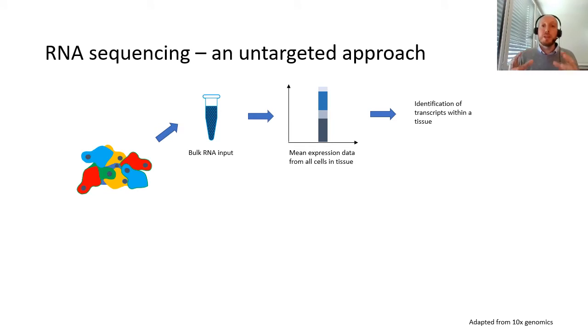So today, the predominant method in the field is RNA sequencing, which is basically a high throughput approach to untargeted gene expression analysis that became possible through the advent of NGS. So in RNA-seq, scientists homogenize pieces of tissue, capture the majority of the transcripts from the lysates, and then sequence them, providing detailed information of what genes were expressed in the investigated tissue. And of course, the increasingly improved genome annotations were a big help in the process of identifying genes.